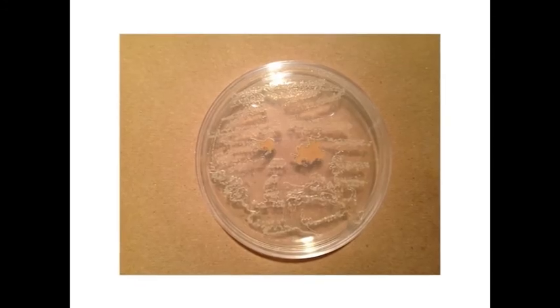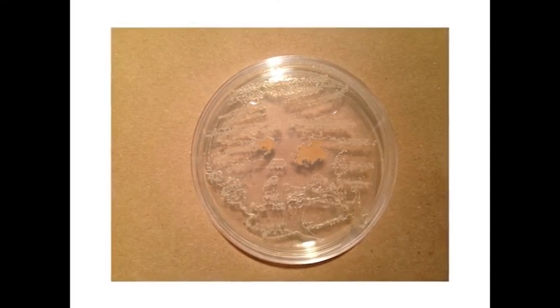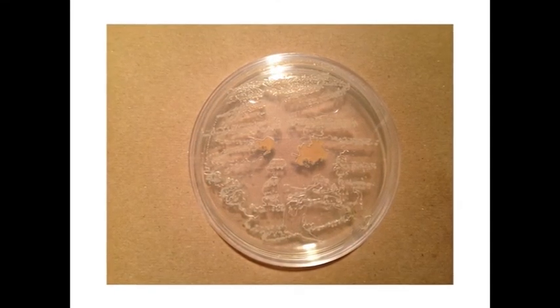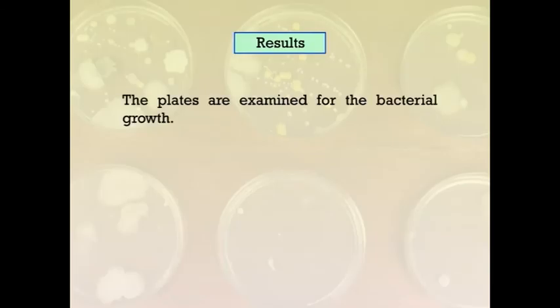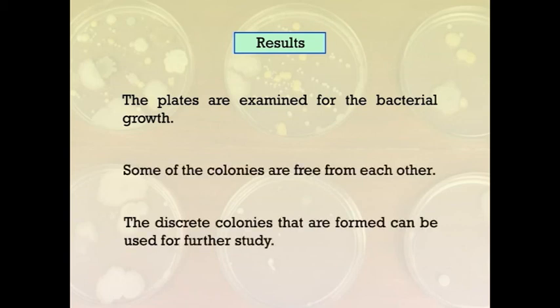Finally, the plates are incubated in the inverted position at 37 degrees Celsius for 24 hours. In the results, the plates are examined for bacterial growth and some of the colonies are free from each other. The discrete colonies that are formed can be used for further study.